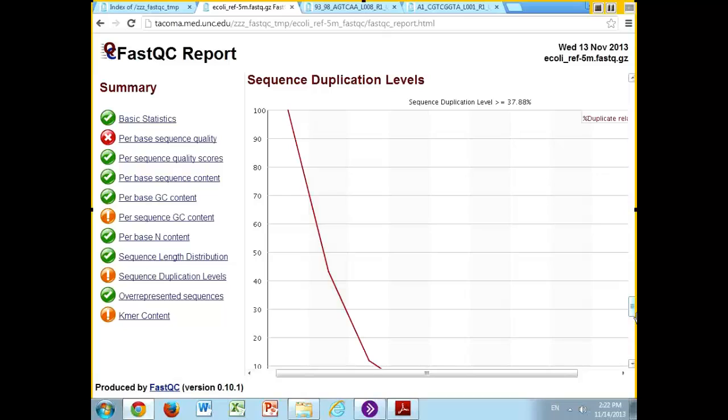Now the misleading part of this is due to memory requirements and the fact that this was written a while ago, before our sequencing machines got quite as good as they are. It really only samples the first 200,000 reads, so you really have to take this graph with a grain of salt. If this graph is telling you you have a lot of duplication levels, it might be something to look into, but it's not a definitely bad thing.